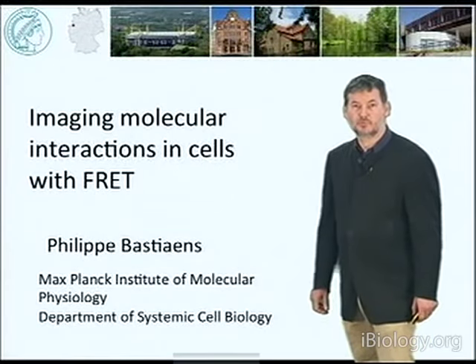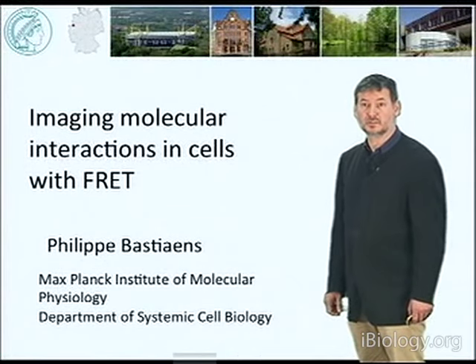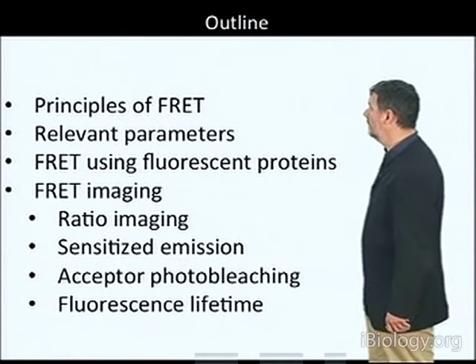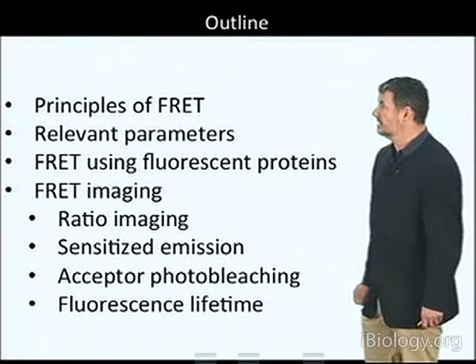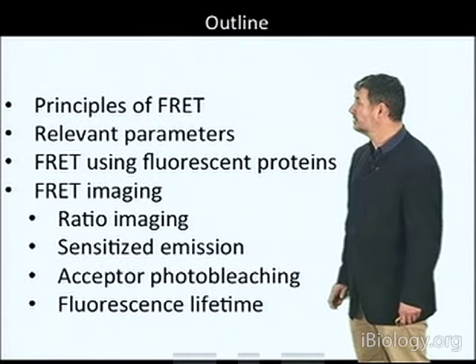In this seminar, I'm going to elaborate on how to image molecular interactions in cells by using Forster Resonance Energy Transfer. So the way this seminar is set up is as follows. I will start off with the principles of Forster Resonance Energy Transfer.